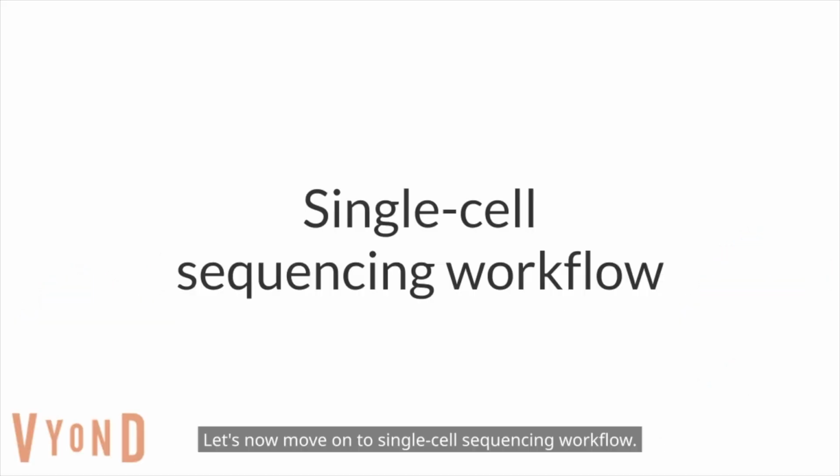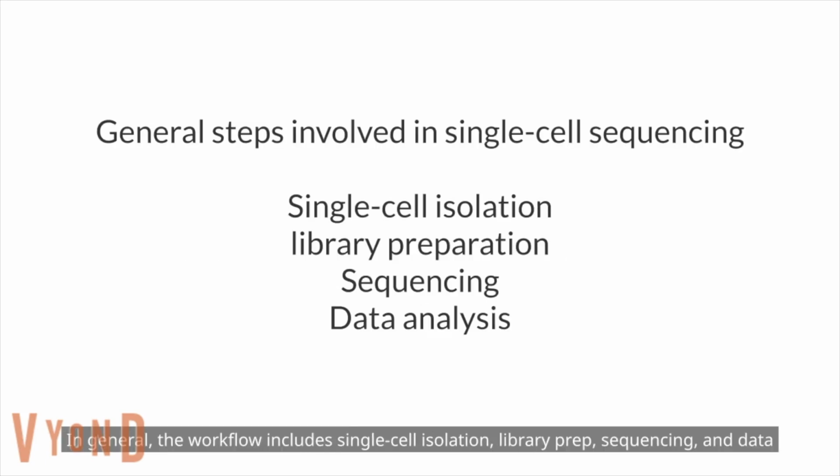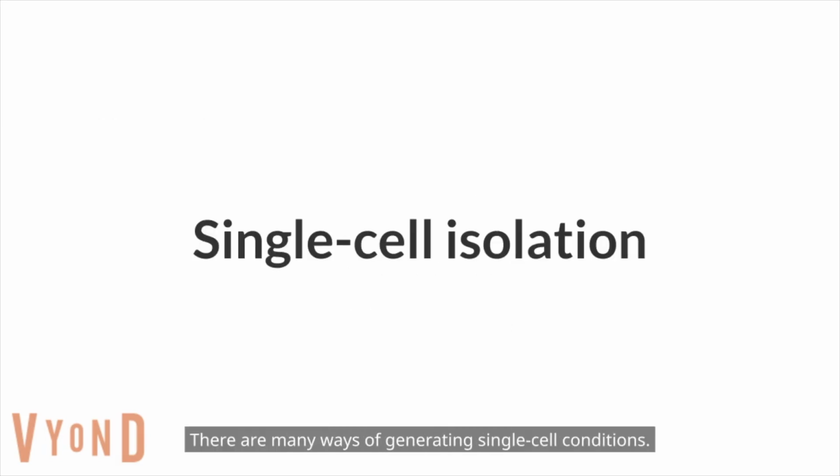Let's now move on to the single-cell sequencing workflow. There are many different single-cell sequencing protocols developed by different companies and researchers. In general, the workflow includes single-cell isolation, library prep, sequencing, and data analysis. Let's start with single-cell isolation.